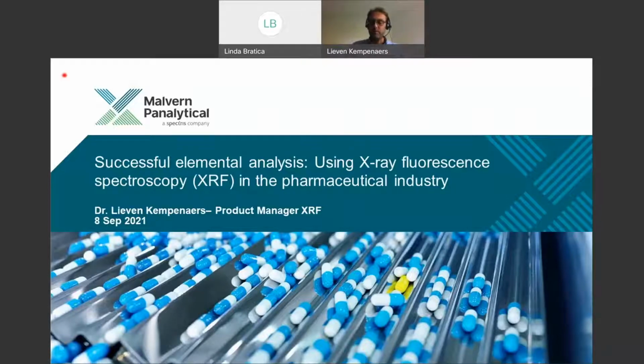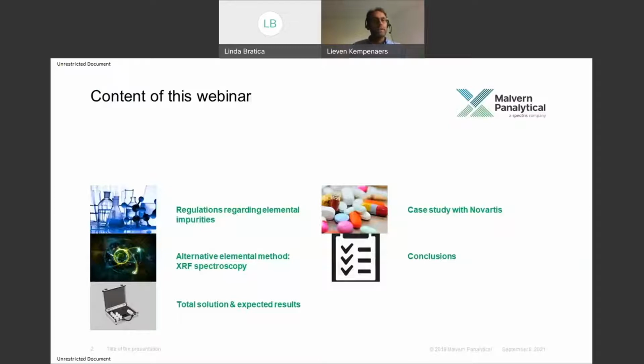So the content of this webinar will be a few topics. The first one, I will talk a little bit about some of the regulations and also some of the changes in the last few years. The second one is I will explain a little bit about XRF and the method itself as an alternative elemental method. The third topic for today will be a few slides on the total solution and some of the results that you can expect with the total solution.